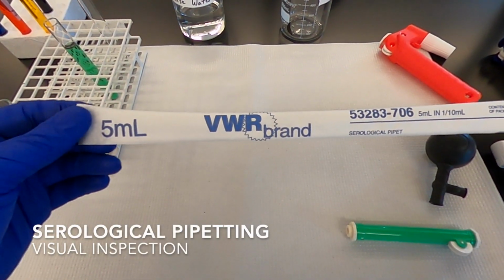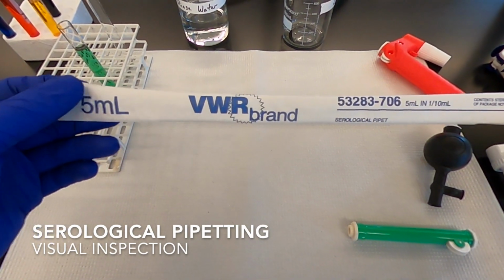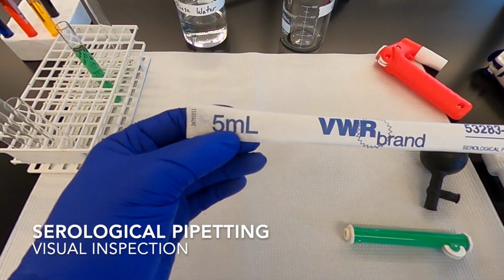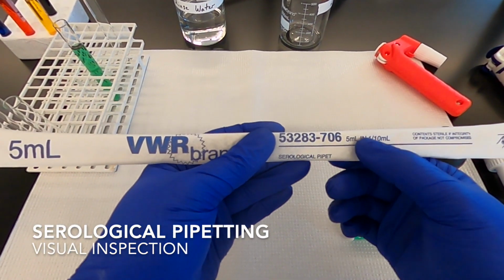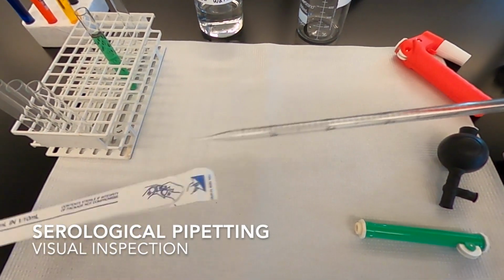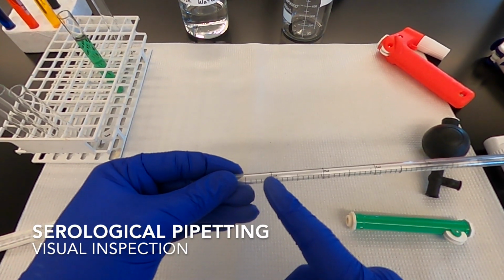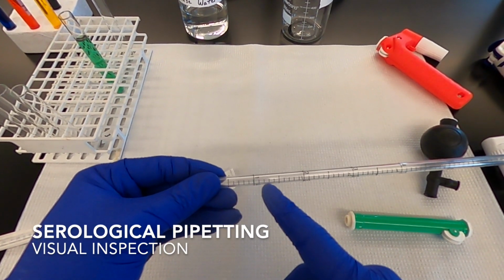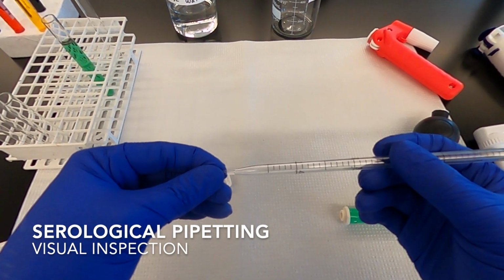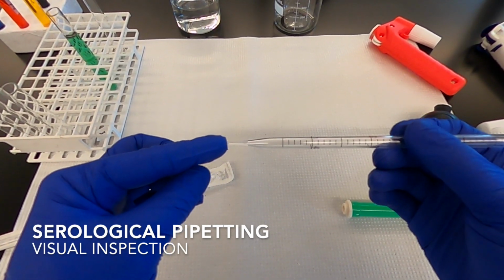So first we're just going to visually inspect the pipette. Here we have a sterile disposable pipette that's typically used in cell and tissue culture. This one is a 5 milliliter pipette, and it is described in 1/10 milliliter increments, which means that the graduations are on it. So if we look between, say, 1 and 2 mLs, there are going to be 10 graduations, each depicting 0.1 milliliters.